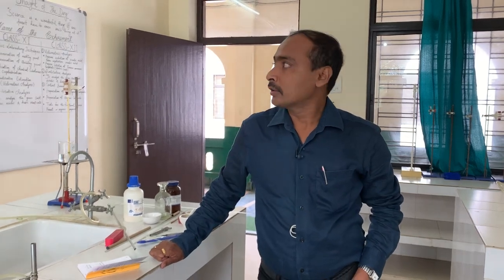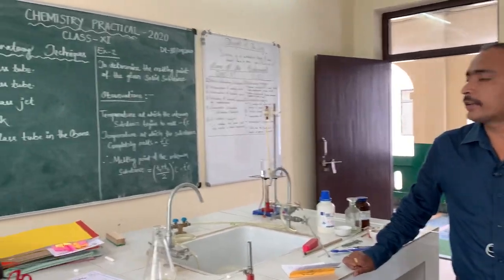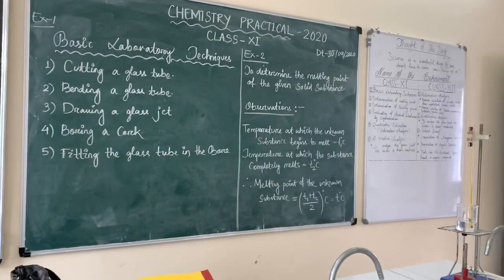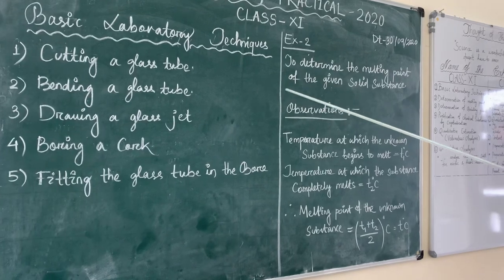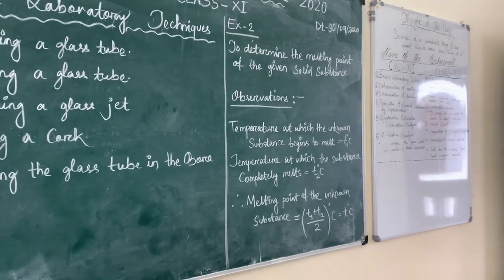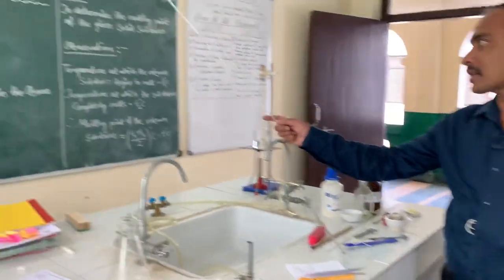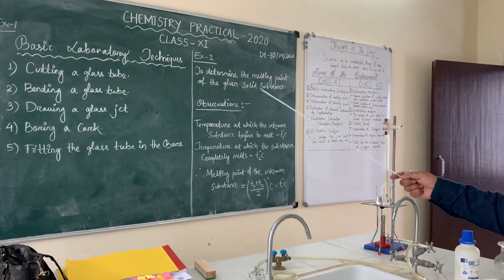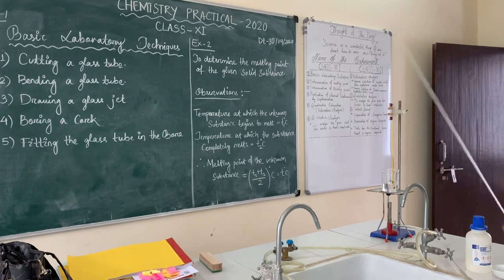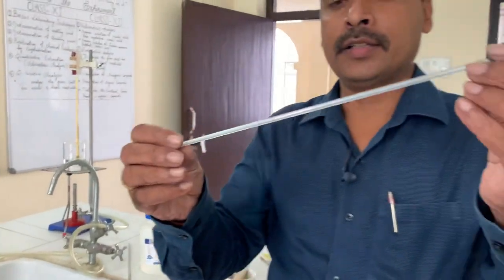Today we will start our experiment number one, that is the basic laboratory techniques. The techniques covered are: cutting a glass tube, bending a glass tube, drawing a glass jet, boring a cork, and fitting the glass tube in the bore. So first, we will do cutting a glass tube.